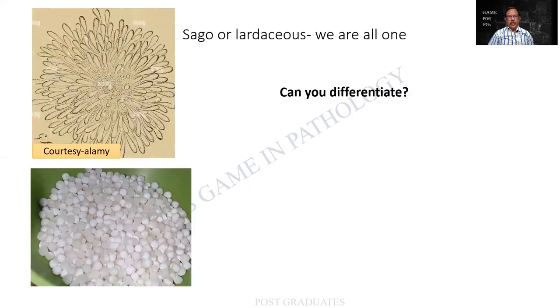Whether it is Sago or lardaceous, we are all one. Picture courtesy goes to Alamy. You can see them in the background also. We should not steal, and we should accept their contribution. This is a case of a lardaceous spleen.